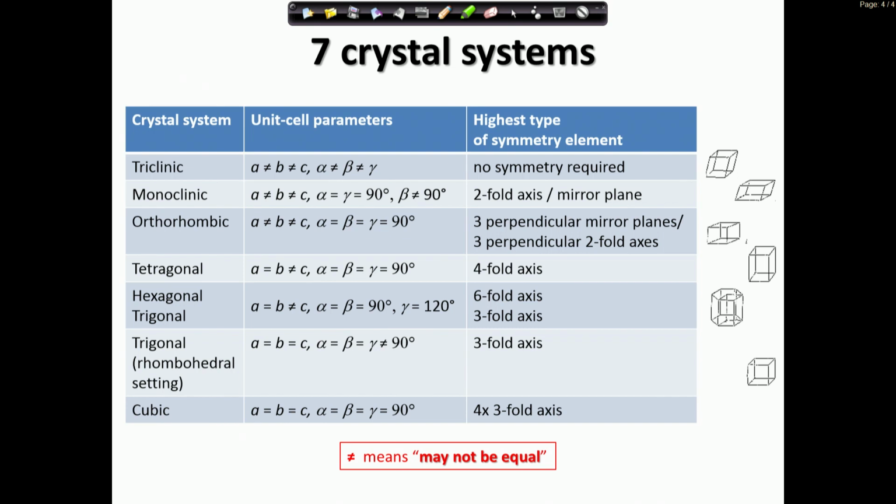So this, what I said, is actually the definition of the crystal system, but this is not how you recognize it first, because usually the first information we have about the crystal structure is not the symmetry, but the unit cell dimensions, so the unit cell parameters. Therefore you see in this central column the properties of the unit cell parameters for the different crystal systems. For example, for the orthorhombic crystal system, you have A different from B, different from C, and all 3 angles between the 3 vectors are 90 degrees. And each crystal system has a different set of constraints on the lattice parameters.